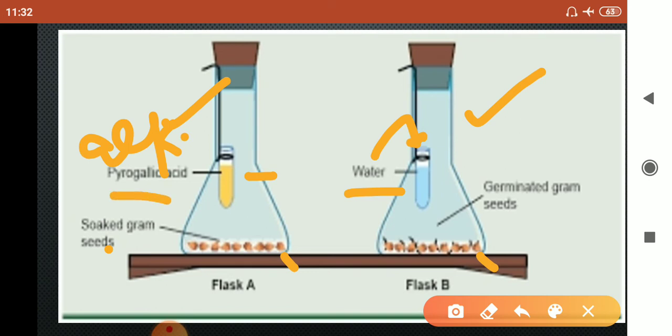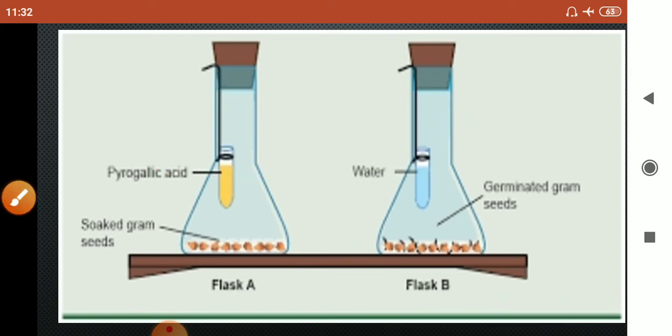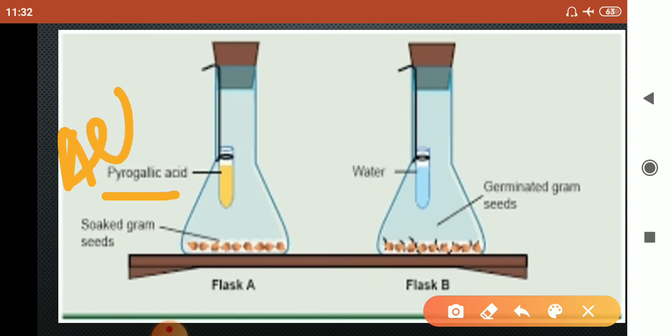...use alkaline pyrogallic acid, not only pyrogallic acid. Now, this alkaline pyrogallic acid has the tendency to absorb the oxygen present in the air. As we hang the alkaline pyrogallic acid in the tube, we should be very careful that not even a single drop should fall inside the flask.